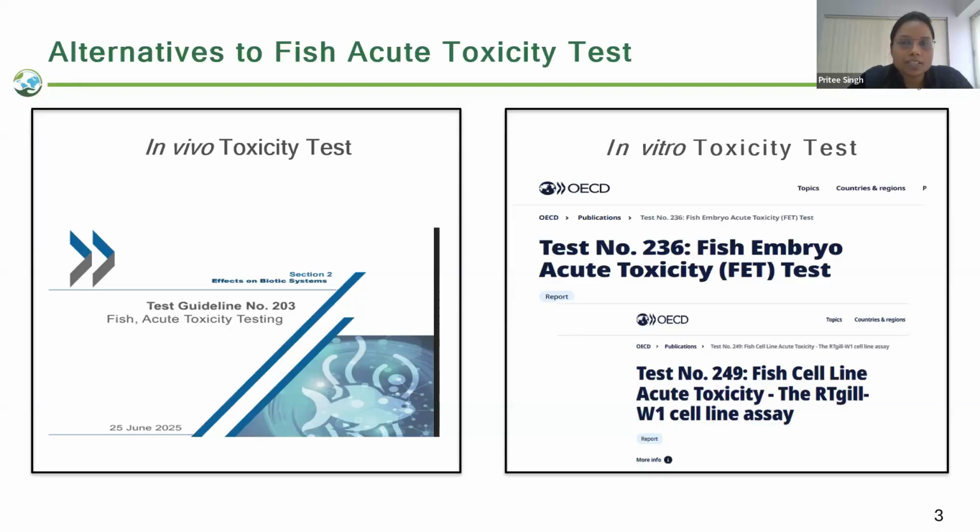We all know that the development of zebrafish can be observed with our naked eyes and can be recorded, or pictures can be captured, by using a microscope. So here, chemicals which have a teratogenic effect can be easily identified, apart from the lethal and sublethal effect or EC50 value. The other important point that we can gain from OECD 236 is developmental deformities. The studies are up to 96 hours and sometimes extended up to 120 hours.